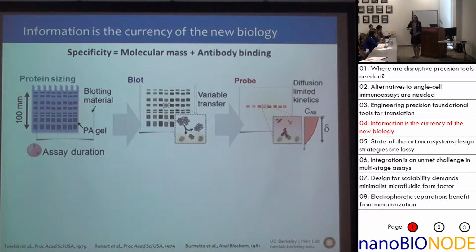For those of you who haven't, I will give you just a little bit of an introduction because it's critical that you understand what that is to understand the rest of the talk. So essentially, you have here something that's called a gel, a slab gel. And essentially, we are looking at the top of it. We introduce sample into each one of these little regions. We apply a potential between the top and the bottom of this little slab gel. It's a polymer. And we basically add our sample here, which is a protein lysate, let's say, apply that potential, and proteins migrate through that polymer network.